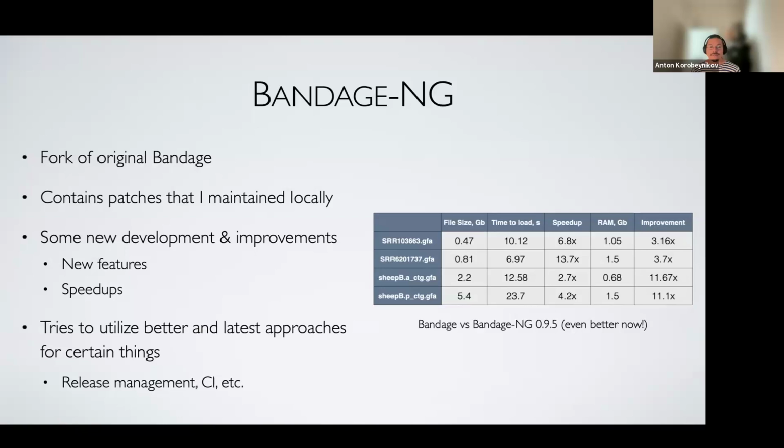So yeah, this is how BandageNG essentially appeared, because over the years I had some patches on top of Bandage that I maintained locally. I think that started from the path support plus some other things. And eventually I decided, okay, probably it's time to just make things public and do some other things in my spare time that I had. I do not have any, but yeah.